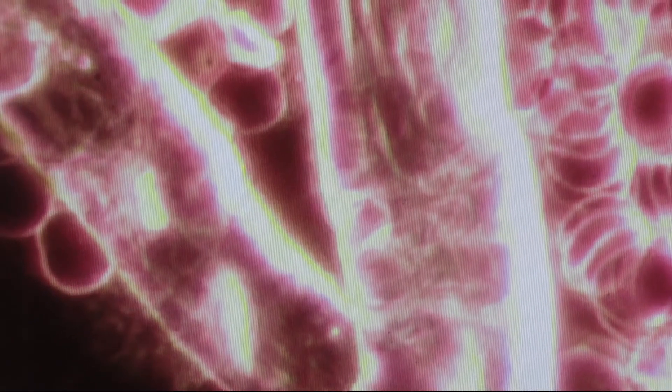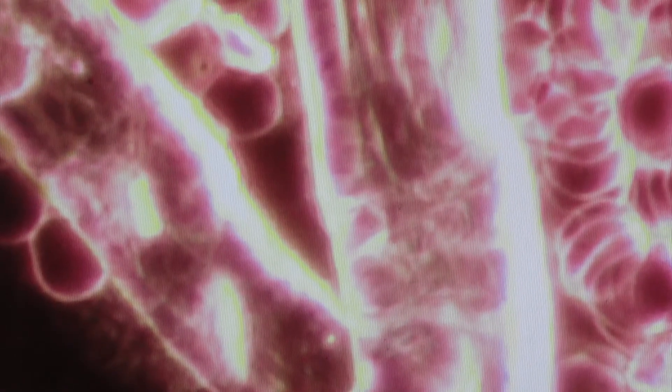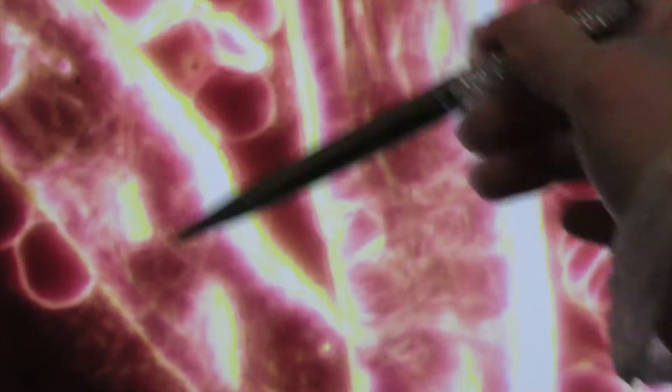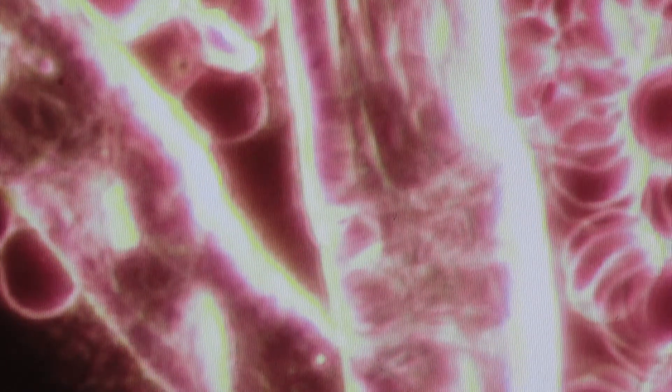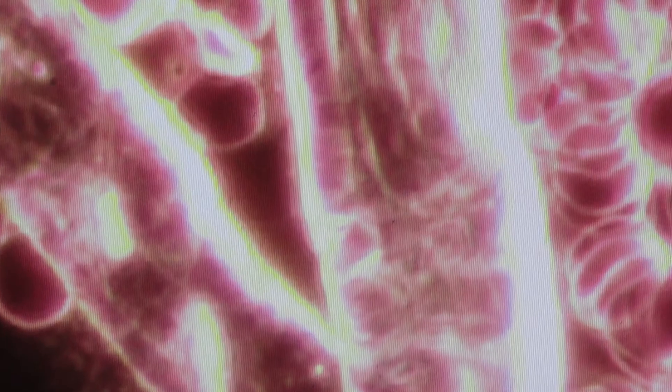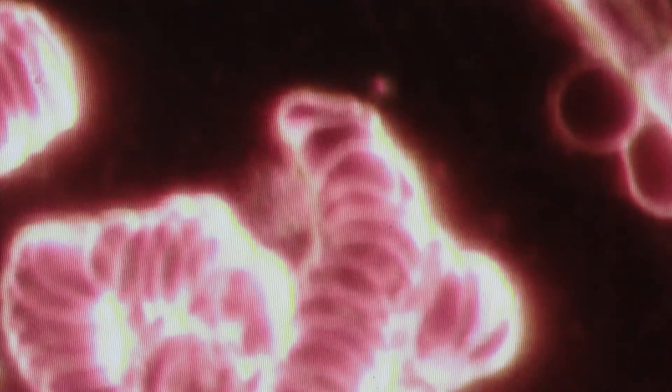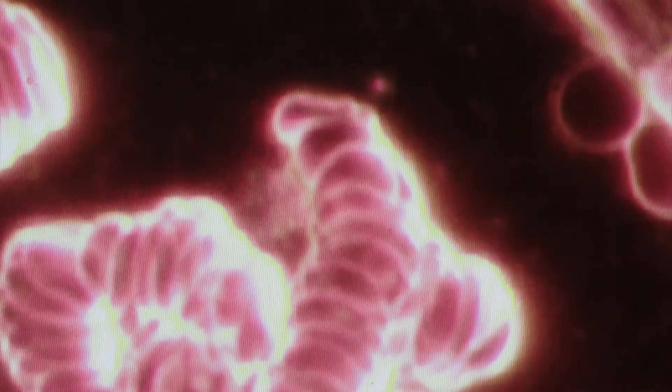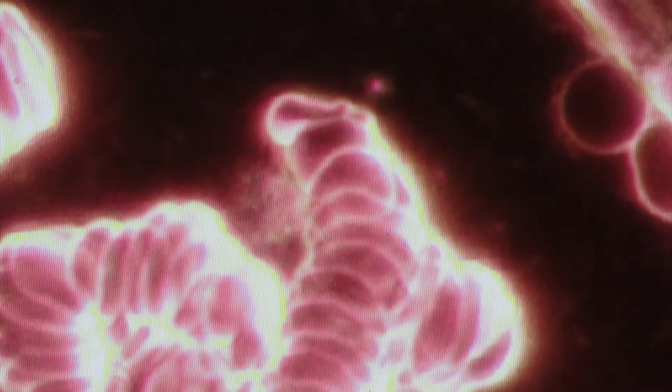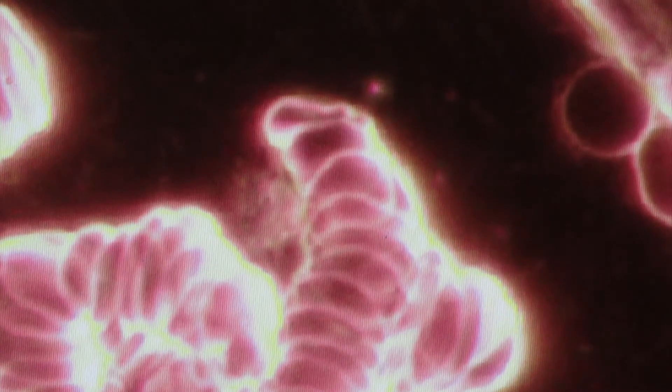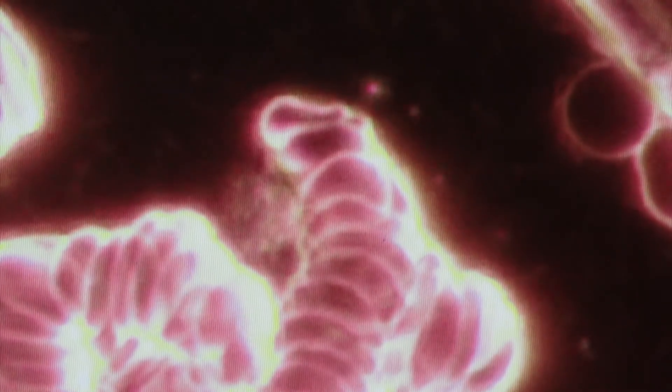What's that? This is Greg. What is that? Are you eating solid food? No. You must be. This is protein. And this is a few days old. Oh, it's a few days old. What did I have a few days ago? Because I'm juicing and I don't eat much. That could be any kind of protein. Likely lentils, beans. Well then, could be chicken. No, I did have some lentil soup last night. And a few days ago as well. This is fairly recent, like within the last couple of days.